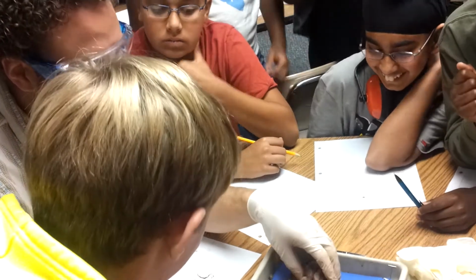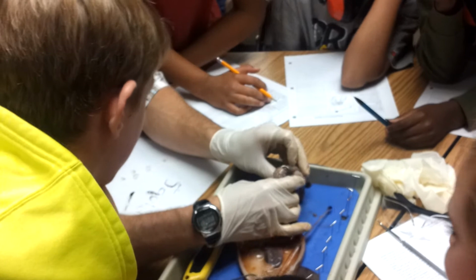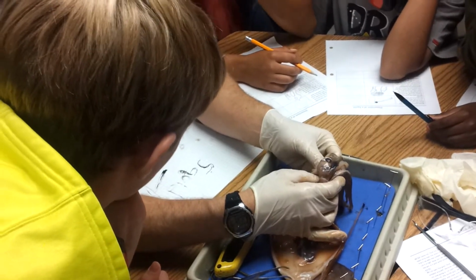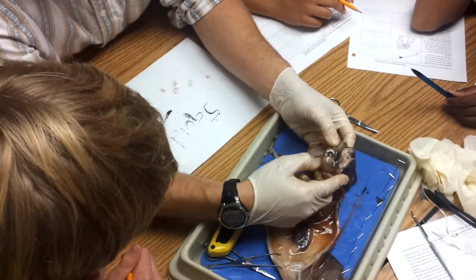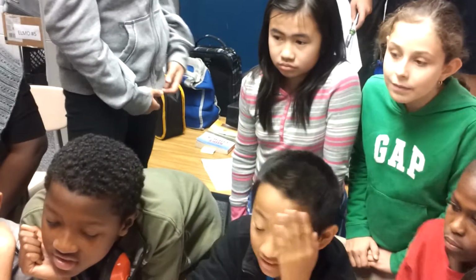Now, the very last thing is the eye. I'm not going to open the eye because the eye is filled with fluid. But look at the size of that eye right there. Squids have the biggest eyes compared to the rest of their body in the animal kingdom. So they're going to hunt by sight. They're also going to do a lot of hunting at night, so they need a big eye so they can see a lot. Okay? There's lots of gooey fluid inside it.